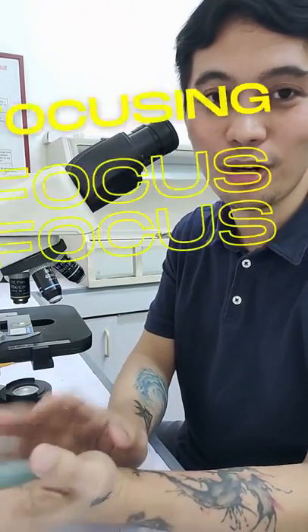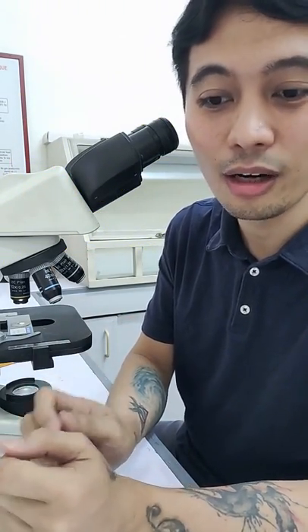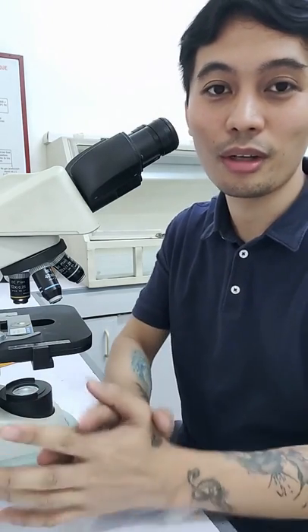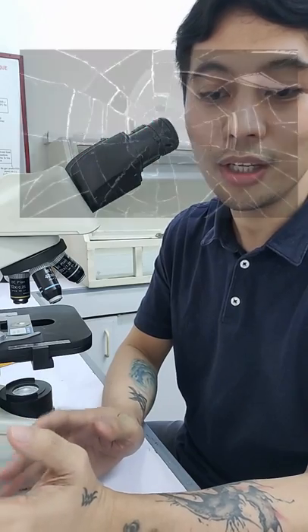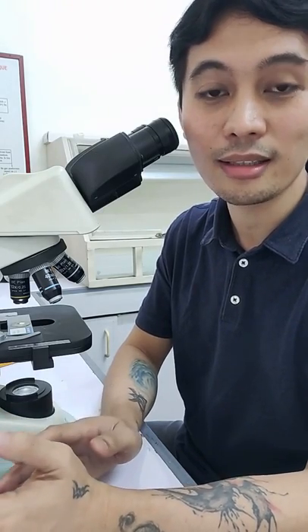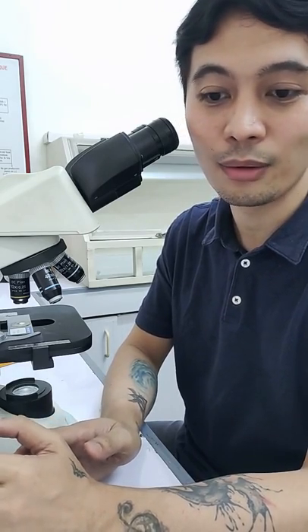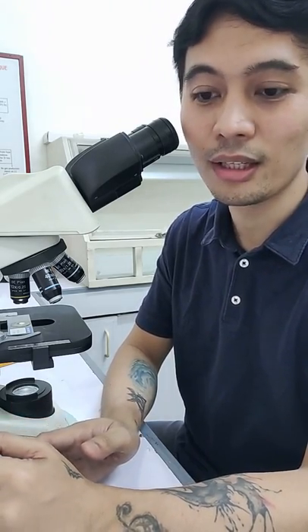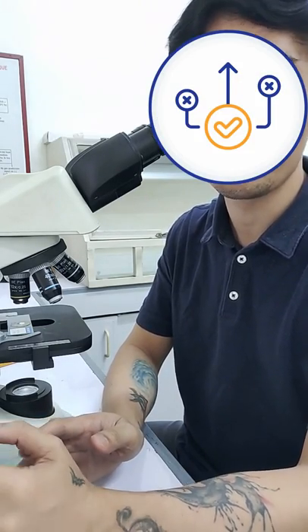Hi there! Now let's go to focusing. Turning the focus knobs recklessly is a long and hard way to focus on the image. If you are using a high power objective, you may even damage the specimen by pressing it against the objective. Before breaking the cover glasses or damaging the objectives, you have to perform the correct way to focus on the specimen.